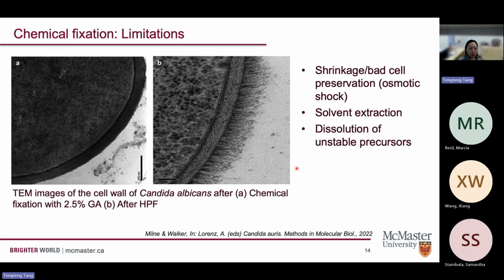So if we compare the tissue that's typically prepared under chemical fixation, we'll realize there are a lot of limitations, or I should say artifacts. The reason being, regardless of how gentle we are when we fix the tissue, when we dehydrate the tissue, and when we embed the tissue, there can always be shrinkage, and we might even observe some solvent extraction or dissolution of the unstable precursors after the chemical preservation.